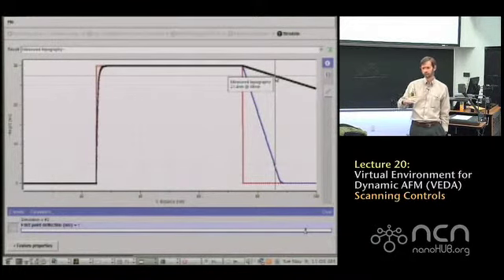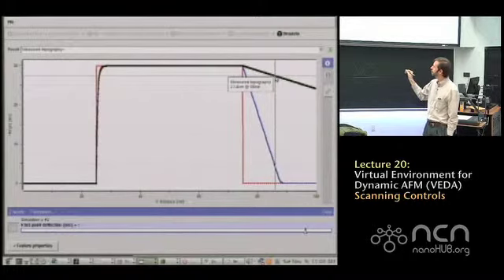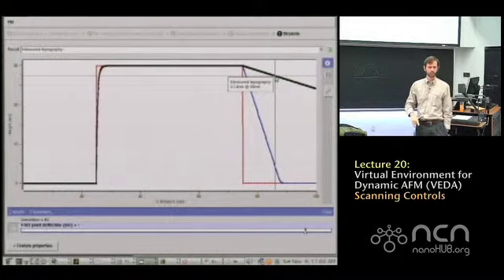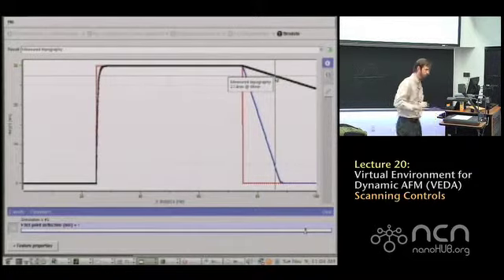So the difference between 0.1 nanonewtons force and 0 nanonewtons force is a small error. So it takes a long time for that integral gain to accumulate. Now you press on it with 1 nanonewton, you've got a lot more force. So the difference now between 1 nanonewton and 0 is a lot bigger difference. So this responds a lot faster.